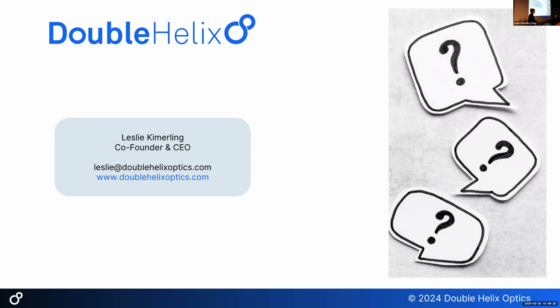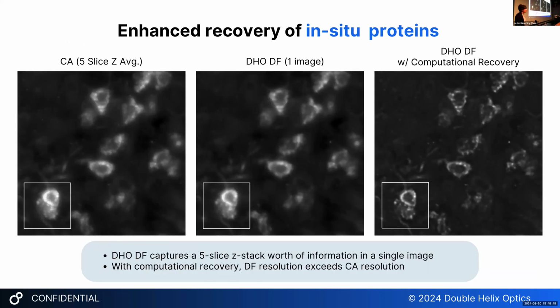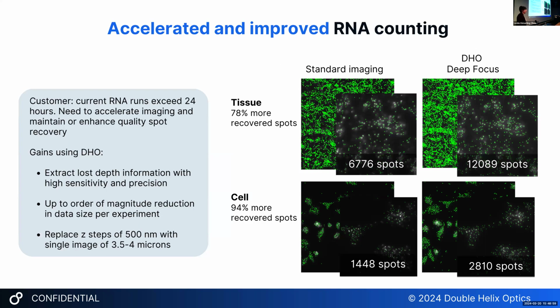Yes. So the video showed what looked like a cartoon animation of exploring some theoretical world. Have you done something similar with real data? Yeah. So I think that was back here. What that was showing was taking you through tissue, where you're looking at RNA and protein. So this is protein in tissue. This is in situ, right? So this is proteomics. And this is looking at RNA in tissue, which would be genomics, right?